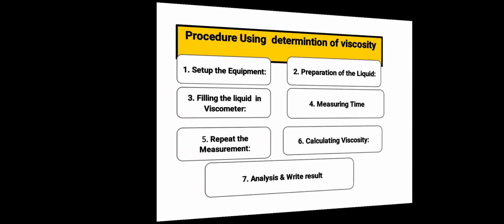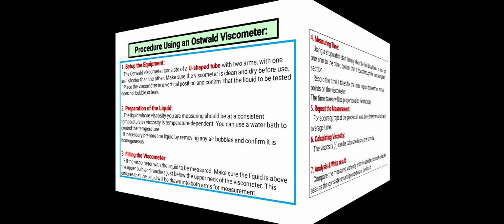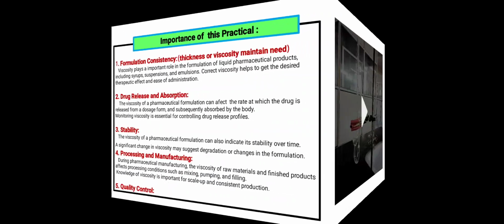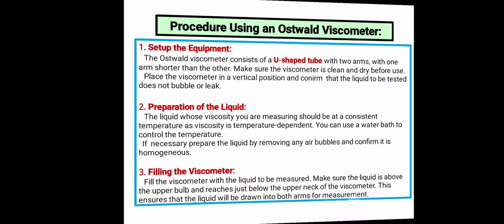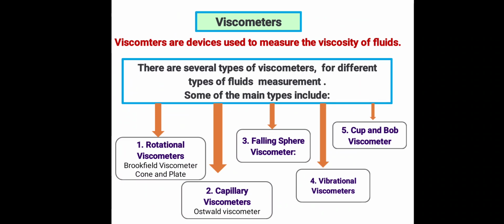Viscometers, procedure, observation, and the importance of this practical. One by one, we'll discuss these in this practical. So first, viscometers.